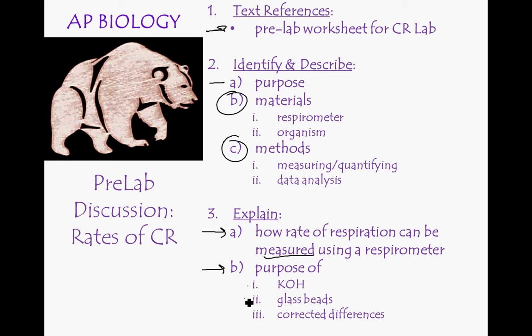You're going to see some glass beads, so why do we need glass beads in there? And then there's this little bit about corrected differences, which has to do with the data analysis. So data analysis, coming down here to the corrected differences part. So let's get right into this.